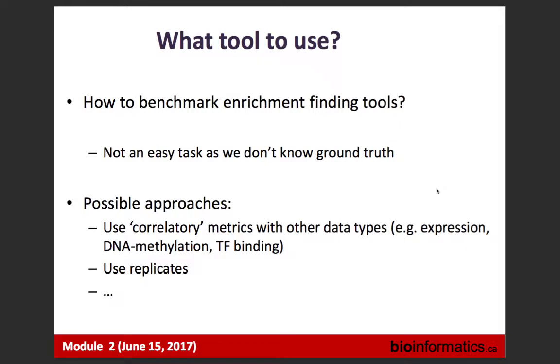And that kind of addresses your question, what tool to use. This is a difficult question. And very often, people just use what one can run, and look at the data to see whether it makes sense. Then doesn't it bias the results, because you pick a tool that matches your results? I agree. In my opinion, it is, to some extent, an open area. If you really want to be very careful with your data, you can do many things without using tools and do a lot of QC, not QC at the read level, but QC at your biology level, that what you're doing is correct.